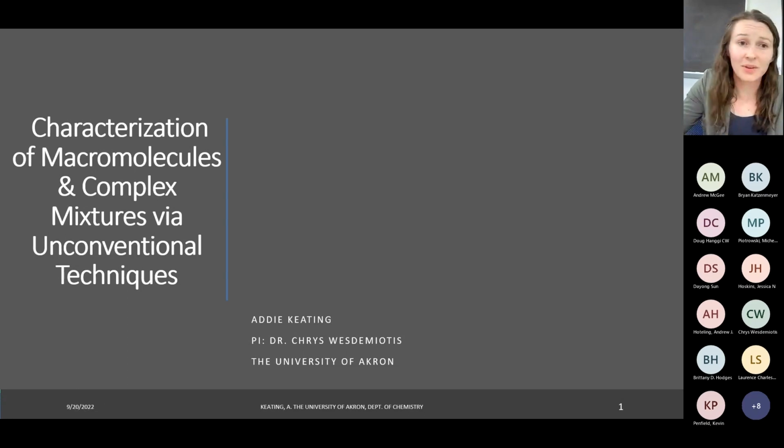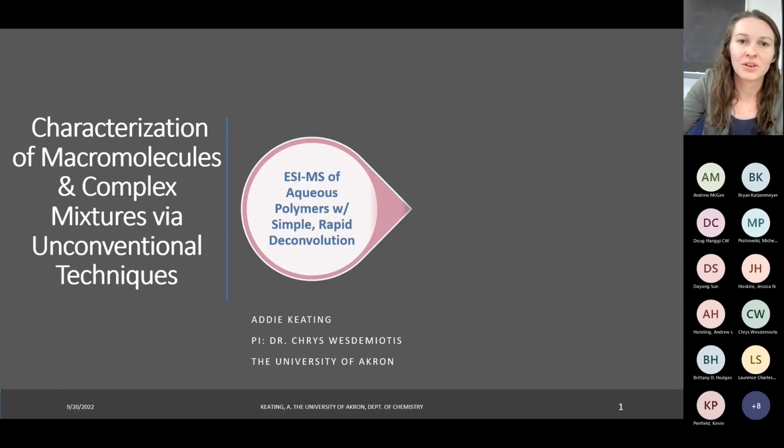I'm going to be going over just kind of an array of projects. So the name kind of tried to fit all of those. So first, we're going to talk about ESI-MS of aqueous polymers with rapid, simple deconvolution techniques, or a single one.